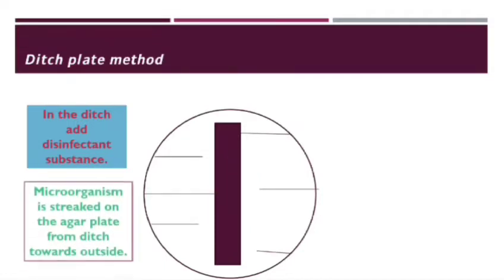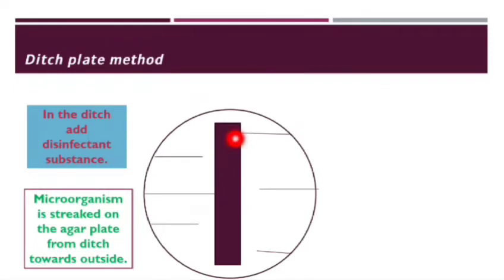Next step is to streak microorganisms. Different types of microorganisms will be streaked in different streaking lines from the ditch towards outside.